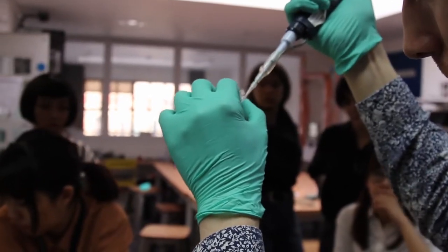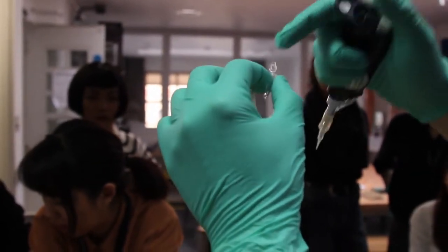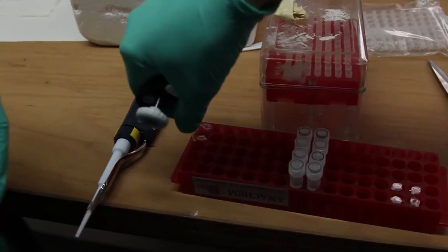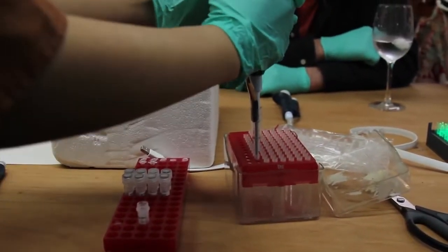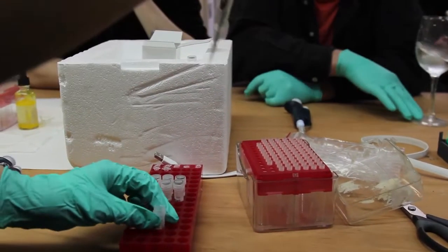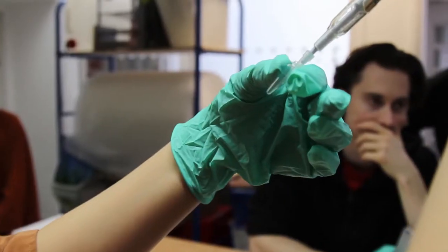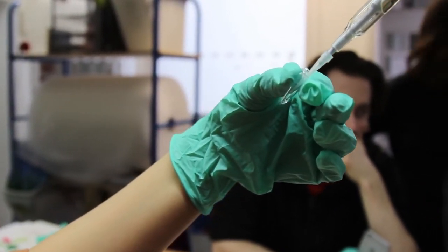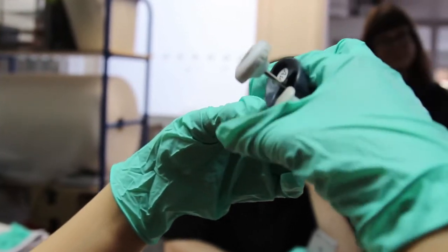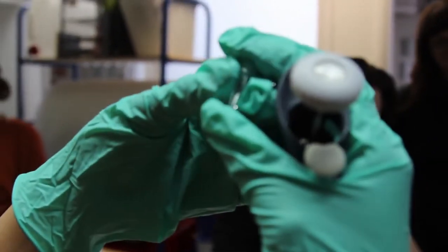What you don't want to be doing is touching things carelessly — your hands are covered in things called RNases that break down RNA, so they will stop the juice working. You want everything started correctly so there is nothing else going on in the tubes. We keep these closed, then open it up, pop in, deliver it, take it out, and close it when you're done.